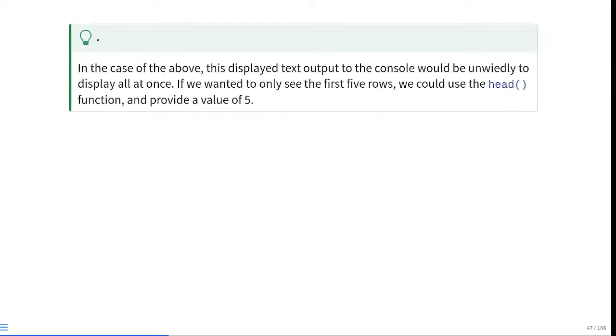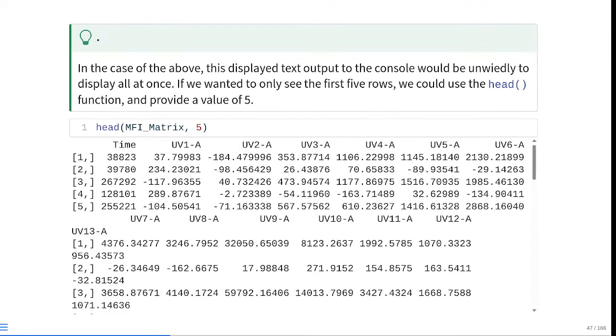So at this point, remember, we have 100 different rows. If we just printed all those 100 rows individually for all 62 detectors, it's going to take up a lot of space within our console. We'll have to scroll up quite a bit.